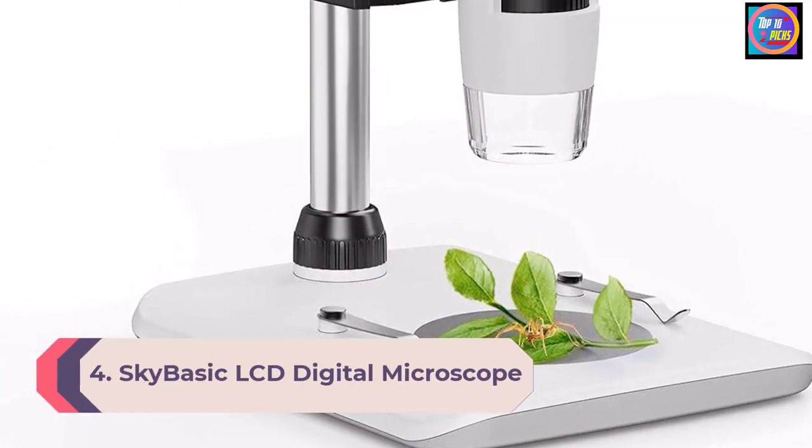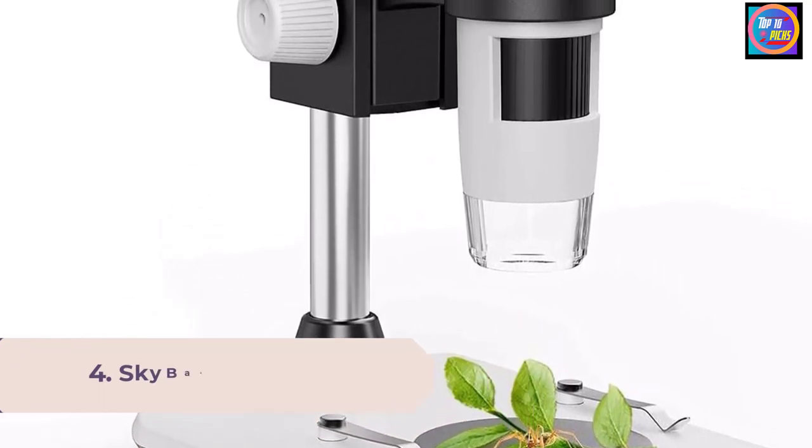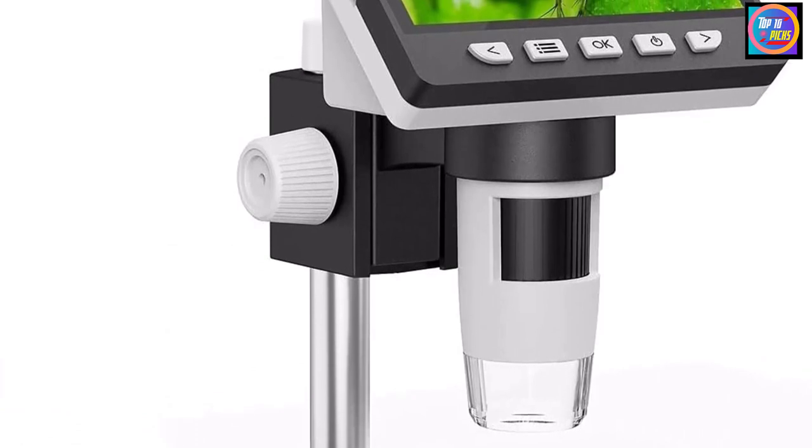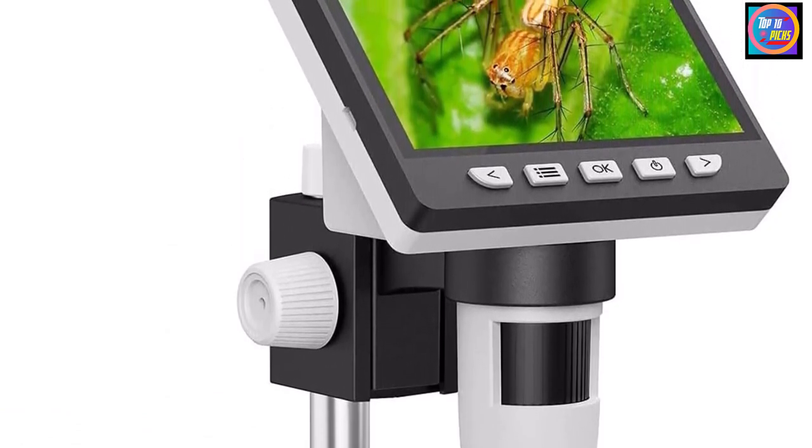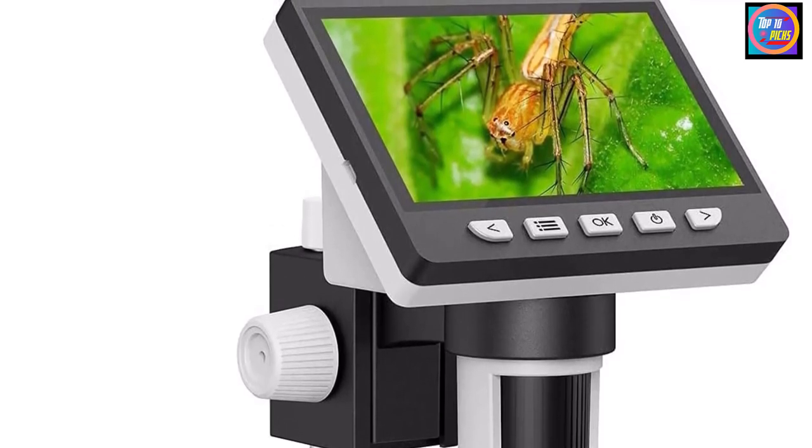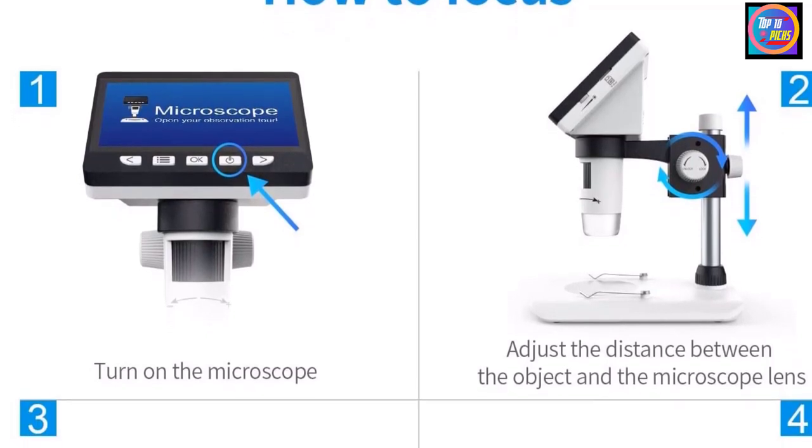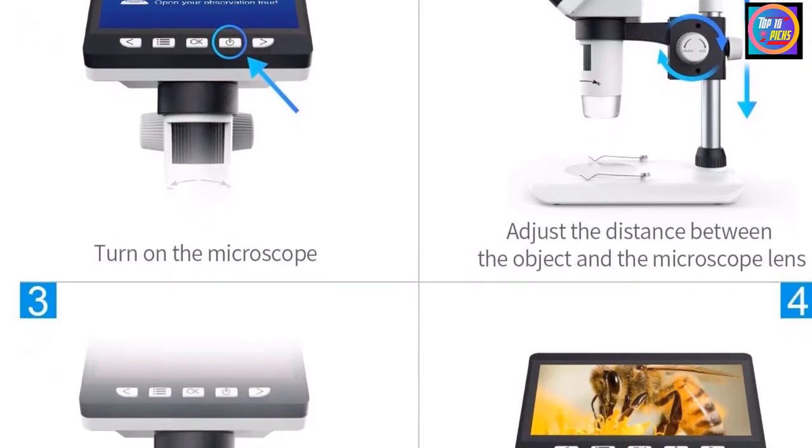Number 4. SkyBasic LCD Digital Microscope. Discover details from 50-1000x magnification to observe minute details in everything, including cells. The added benefit of a high-quality camera enables you to witness microscopic details without squinting your eyes. This is one of the best microscopes to use in low-lit areas as it's equipped with 8 built-in LEDs so you can adjust the brightness to your desired level of illumination.